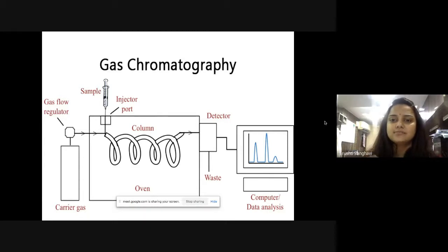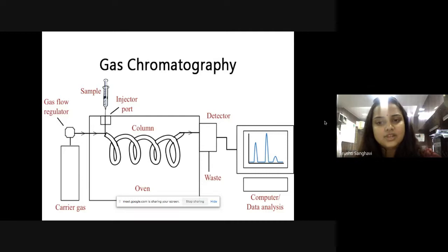Ionized state is, they emit a certain energy. Each individual molecule has a predetermined ionization state energy that is captured by the detector. And that energy that is absorbed is seen on the screen as a chromatogram. And then you do the analysis.